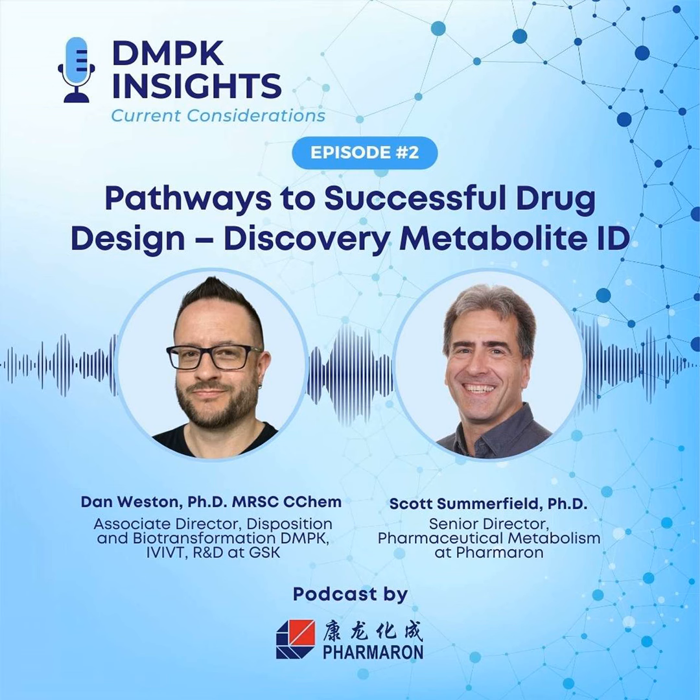But that said, we are aware that we could be introducing a prediction bias there, and that's something that we're continually aware of. So the oversight of a skilled biotransformation scientist to look for unpredicted, non-predicted metabolites, however you would phrase it, is really critical. So this is software driven, but overall biotransformation expert led, if you like.